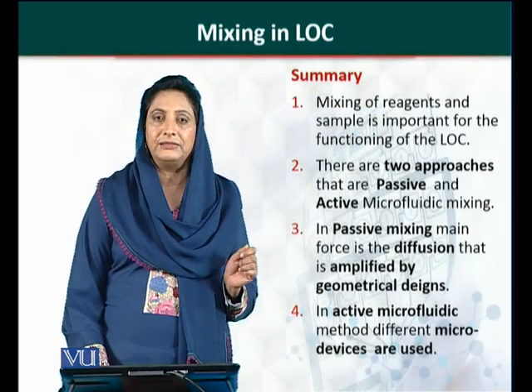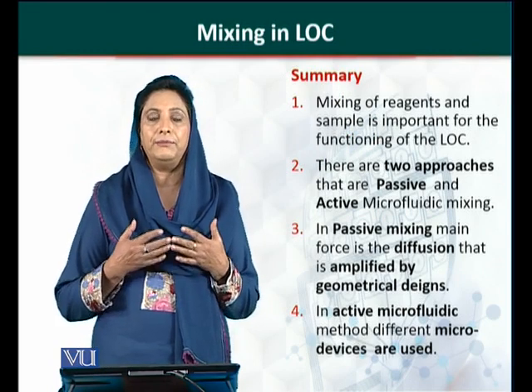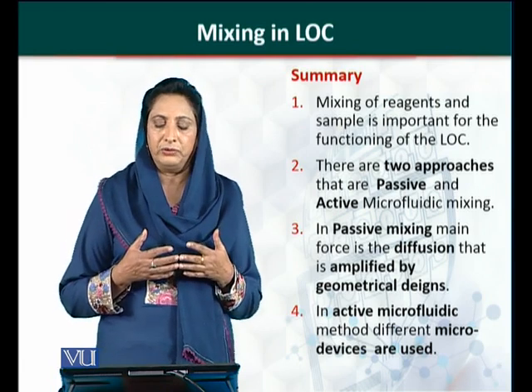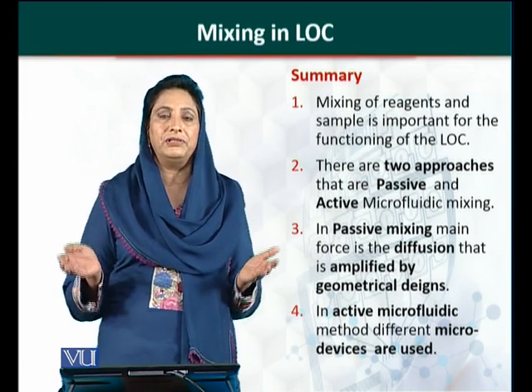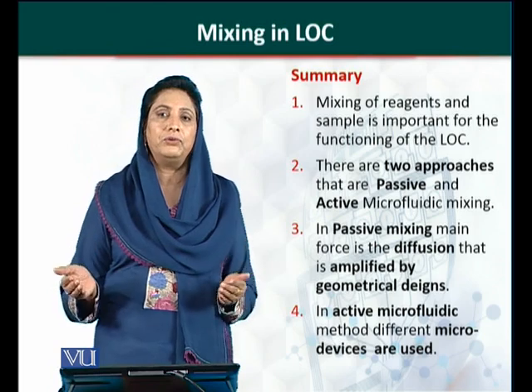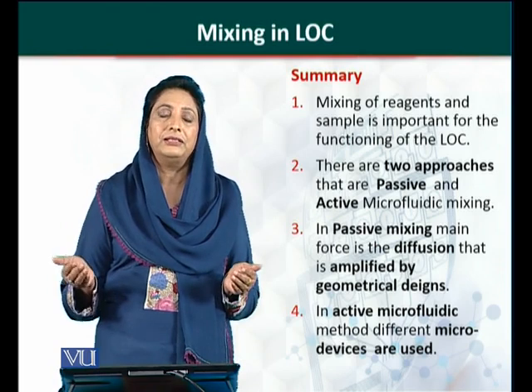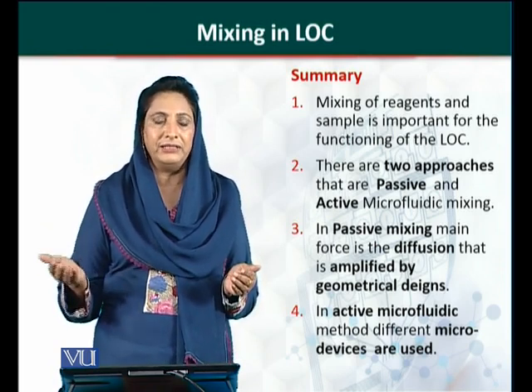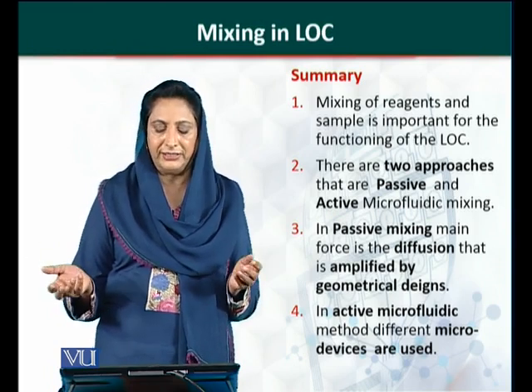Now, in summary, mixing of reagent and sample is an important, or rather the most important thing in lab on chip technology. There are two approaches for mixing the reagents with its sample. First is a passive approach. The second is an active approach. In the passive approach, we can use special designs to increase the sample mixing, or we can use different geometrical designs.